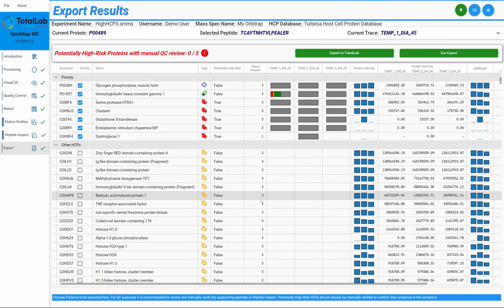You can de-stress your workforce, your people doing this. If you've only got a small team doing this, and they've got say 90 projects to run through in a quarter, they're going to be able to do that much easier and much quicker by using our software than the currently available tools. But don't take my word for it.